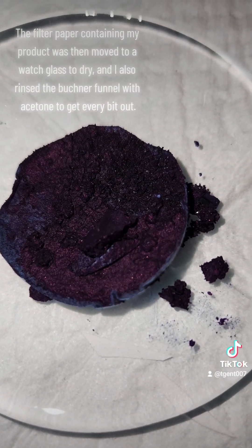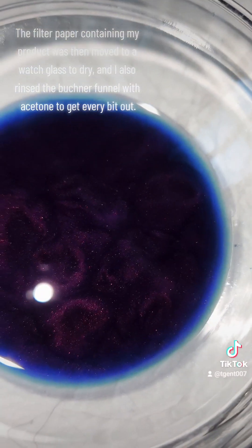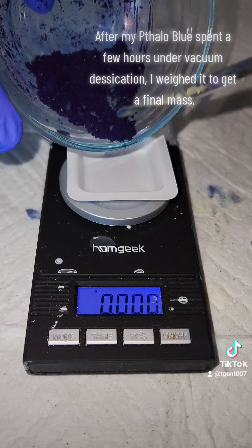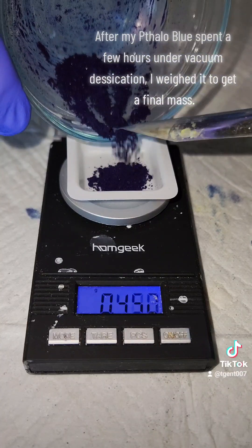The filter paper containing the product was then moved to a watch glass to dry, and I also rinsed the Büchner funnel with acetone to get every bit out. After my Phthalo Blue spent a few hours under vacuum desiccation, I weighed it to get a final mass.